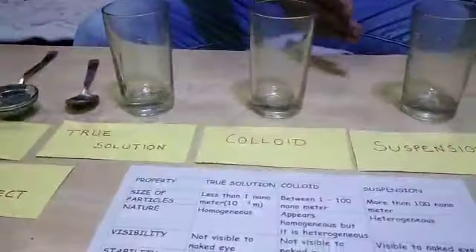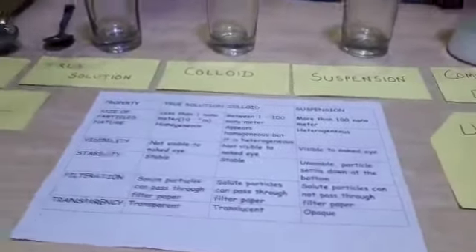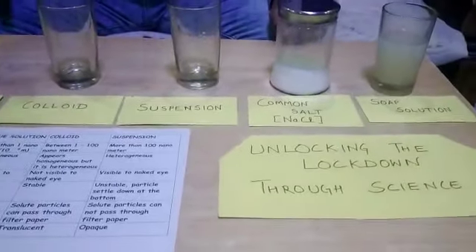Today, I, Kuldeep Singh from Neera Public School, am going to show you some fun science activities for class 9. We are going to learn today about true solution, colloid, suspension and their properties. We are also going to learn about Tyndall effect. So let's start the preparation.